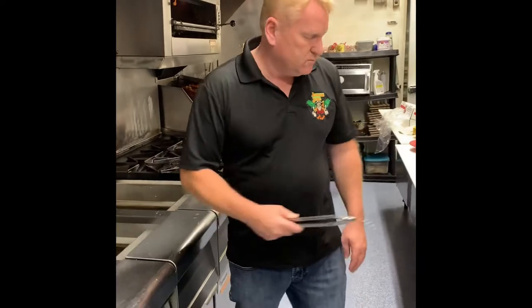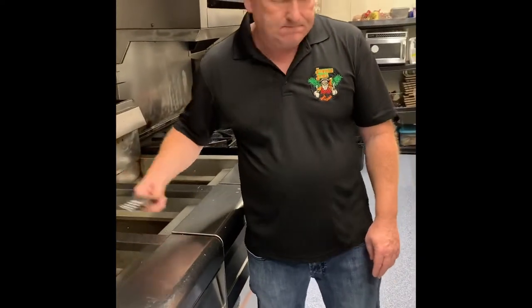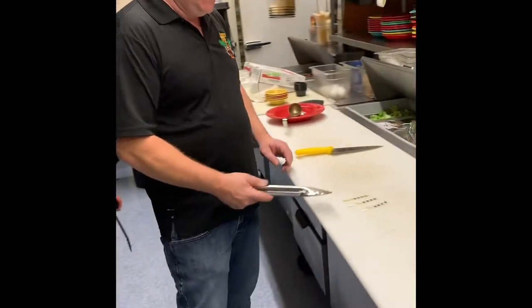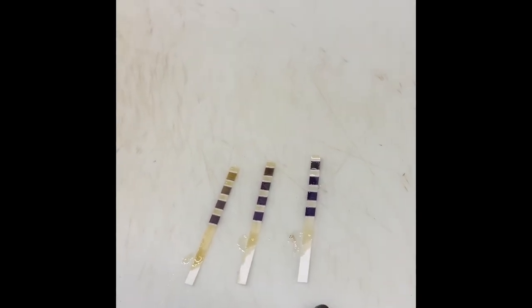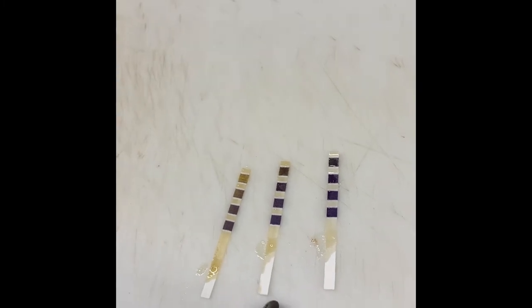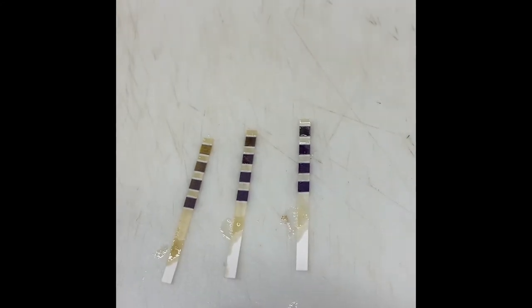That's fryer number two, and this is fryer number one. Fryer number one, which is our newest oil, is showing a little bit of yellowing on the top strip. Fryer number two, which is three days old, is showing a little bit more yellowing.